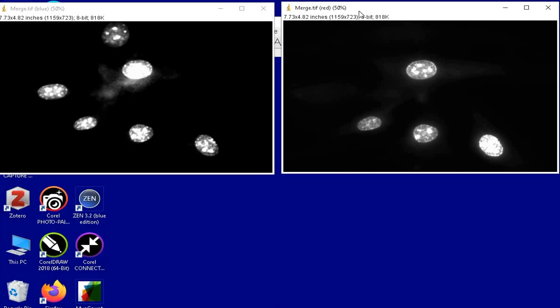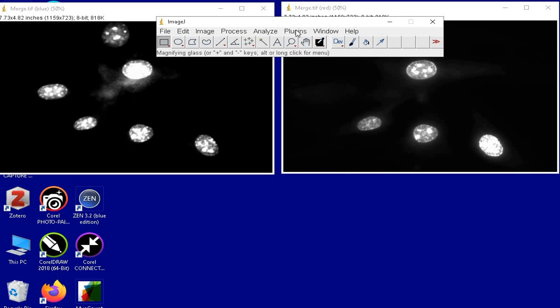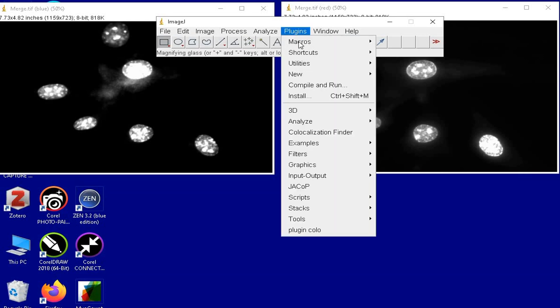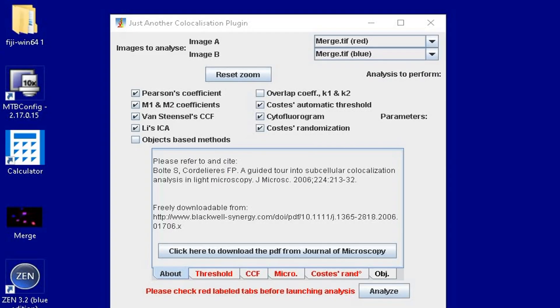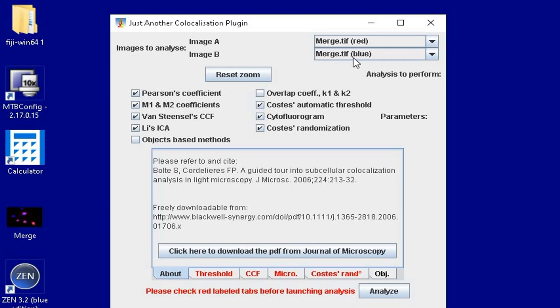To use the JACoP plugin for colocalization analysis, click on Plugins and then click on JACoP. This window displays all the parameters to be input for the colocalization analysis. The images to analyze are imported by default under Image A and Image B. Next, check on the following options except overlap coefficient K1 and K2 and objects based methods.